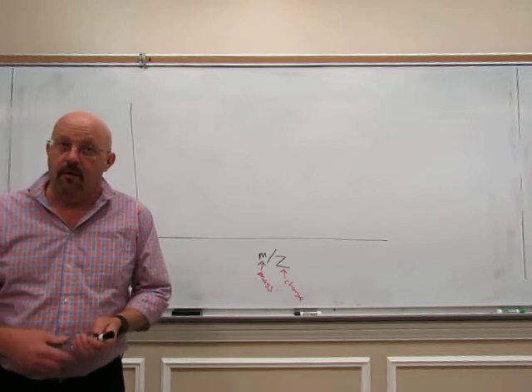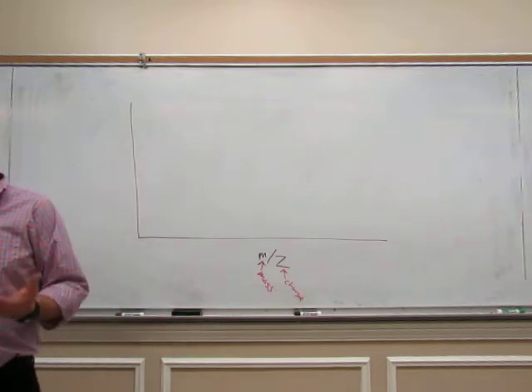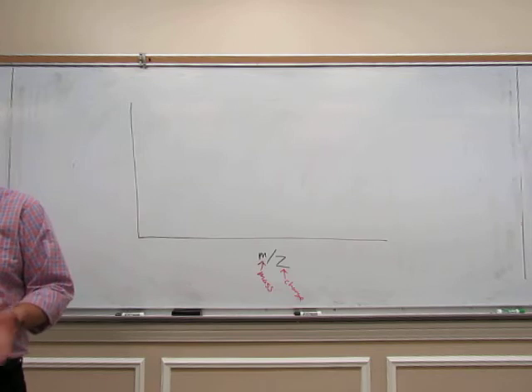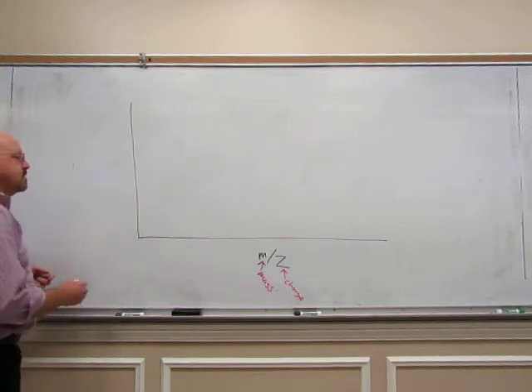But that's very rare. For our purposes, we're only going to have a charge of plus 1, so we're dividing by 1 all the time. No big deal. So the mass you see is the real mass. We're not going to deal with any dications or trications. They are extremely rare.